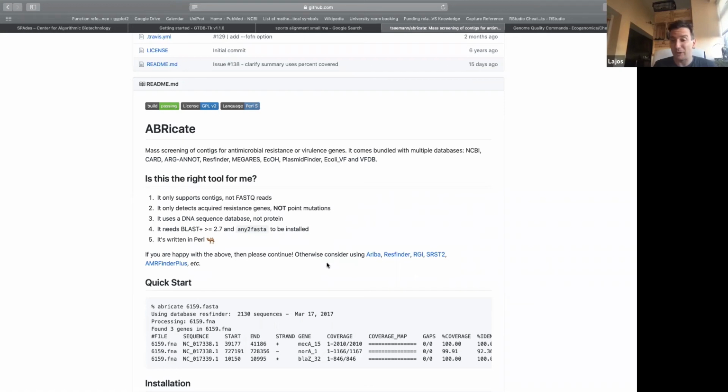It's a bit complicated, but if you know that there are, for example, genes that are always identified as a hypothetical protein, but you know what those genes are, then you can create your own hidden Markov model pattern for those genes and ask PROKKA to include your custom HMM profiles during the run, and it will annotate those genes much better from that point. It's a bit more complicated because you have to build up that HMM profile.